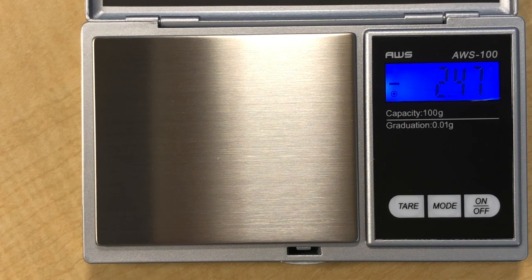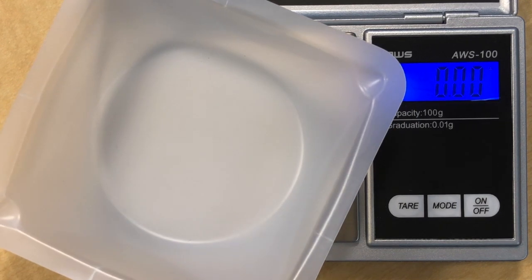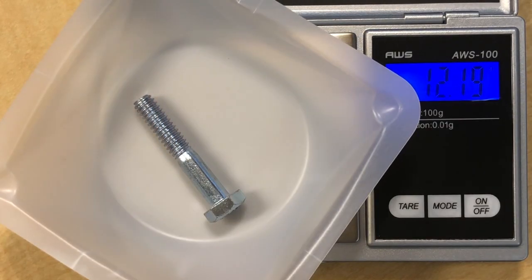Notice that the scale reads negative 2.47 and that's because the weighing boat weighs 2.47. So the idea of using the scales is to press the tare button so that it zeroes, meaning that anything you put on reflects the true mass of the item because the weighing boat has already been taken into consideration.